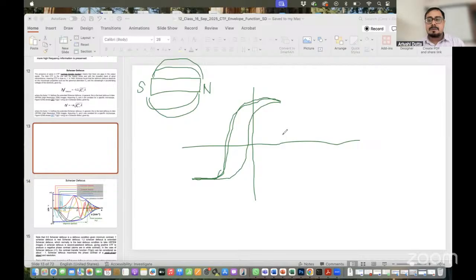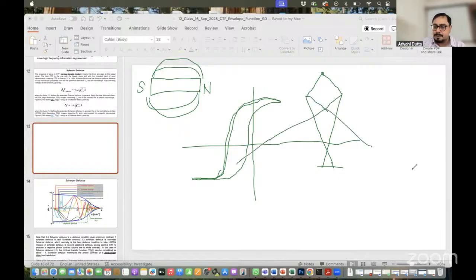Now, in this particular case, when you have a very low mag, it means your magnetic field is not that strong. Because if you want to image this particular dot, the electron beam is coming like that, then it will converge at some particular point here, and give you an image here. So here you can see the magnetic field is not very strong, it is weak. Now, if I have a very strong magnetic field, it will spread all over like that, and it will give you a very large image.